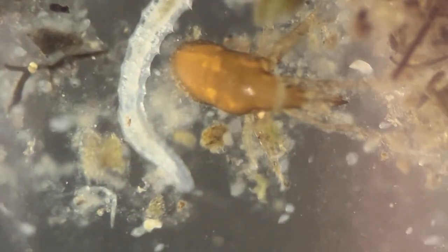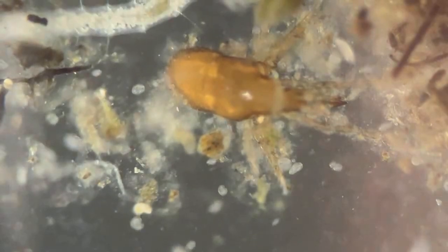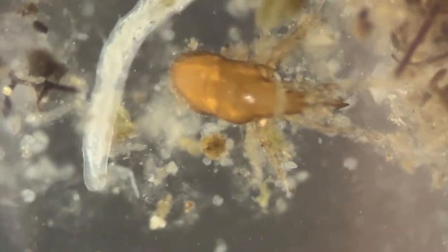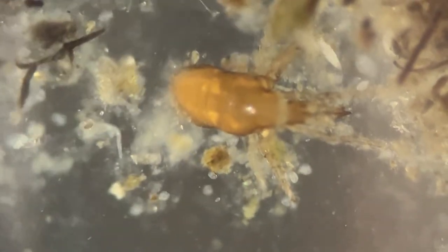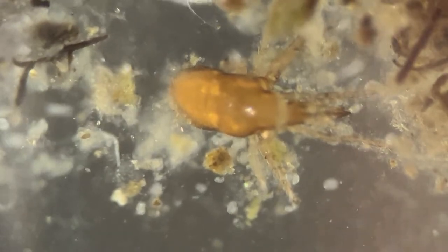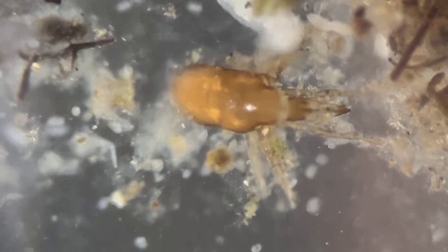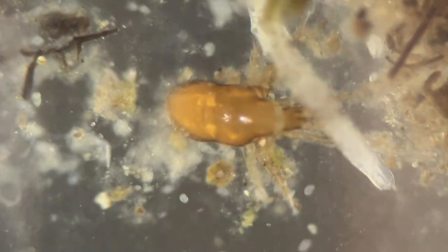Some hair samples which I had gathered, I had accidentally dropped them. Let me collect. Okay, now I'll find something to cover that other eyepiece so that we get a more appreciable view. I'll be right back.